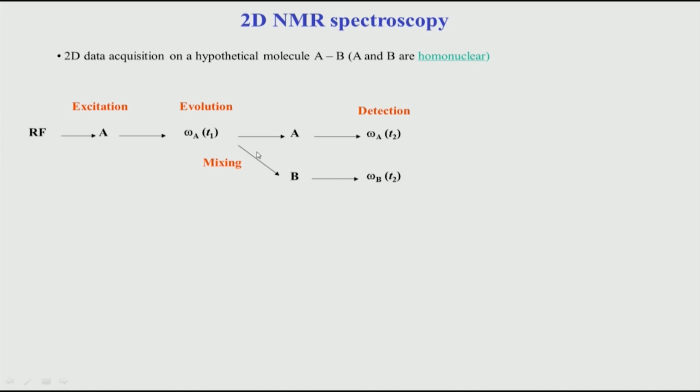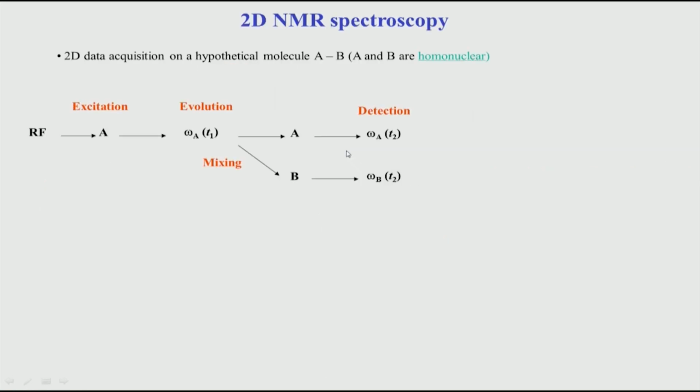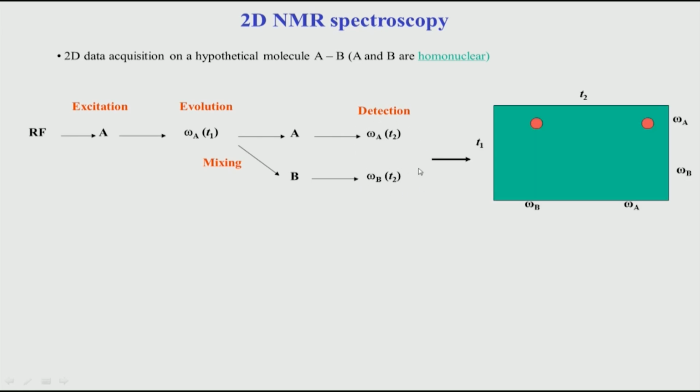So, this is basically what is shown here. You have A which has kept something with itself, it could not transfer completely to B, and now I apply the second pulse. So, now let us go back to this picture. When I apply this second pulse, it is going to be applied on both A and B, because as I said, we do not consider A and B as separate, we call all of them hydrogens. So, the pulse is applied to all of them at the same time. So, when that happens, now if I do a Fourier transform, I will get 2 peaks instead of 1.